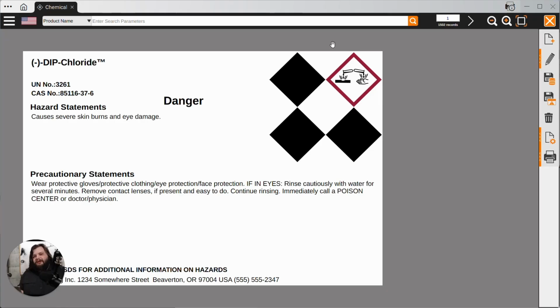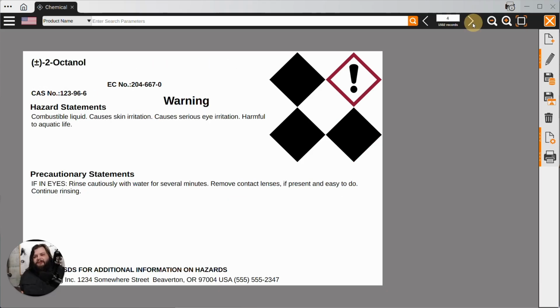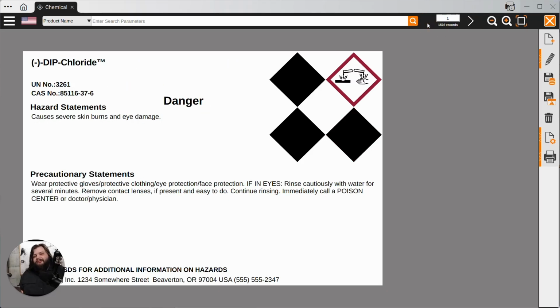The first thing that I suggest doing is determine which database you want to be in for the chemical module. By default, you'll begin in the chemicals database, which will have all of our pre-made chemicals already loaded in. If it is something though where you want to work within a unique database that only has your custom labels, that can be done as well. That is something that I personally am going to do, but that's not needed since we do have the ability to search for labels as well through our search bar.